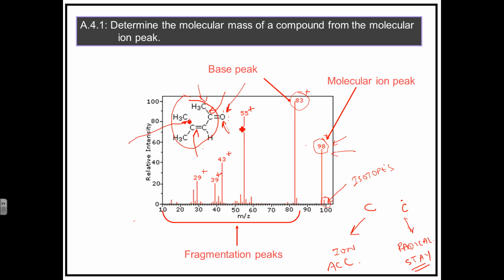Just before we advance to the next slide, I just want to highlight one thing about this particular fragment, and that is some of the characteristic numbers. Now, if we say that this to the far right is the entire molecule, and this first big peak to the left is a fragment of the molecule, then the difference is the piece that has been knocked off, or the piece that's been left behind. So we can see here that there is a difference of 15. Now that's the molecular mass of something that has been left behind.